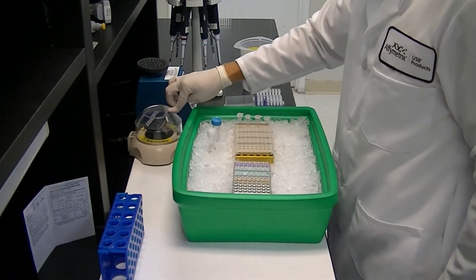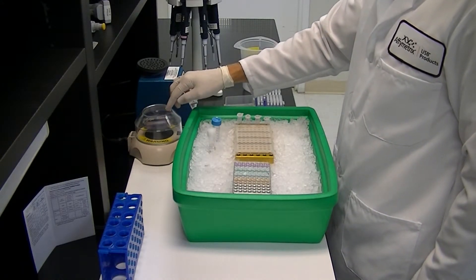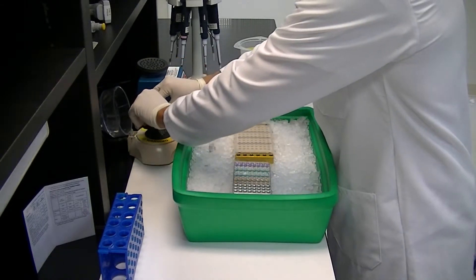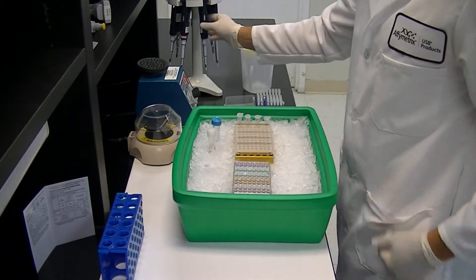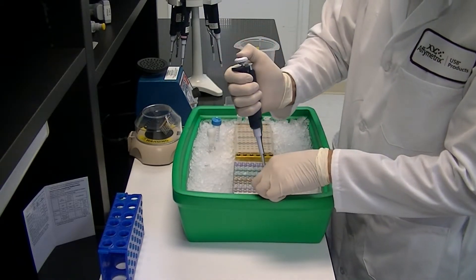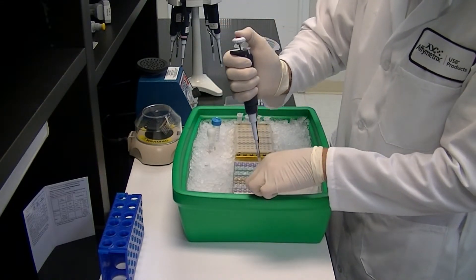Briefly spin to collect contents, then serially transfer in 1-to-10 increments down the strip, repeating mix and spin steps after each transfer and leaving the last tube with water only for the no-template control.